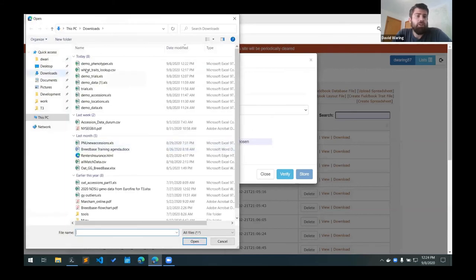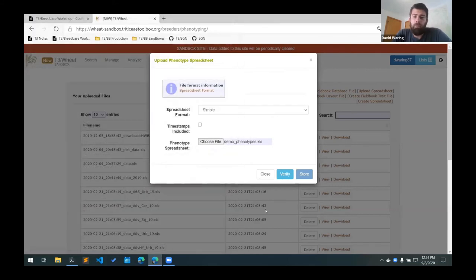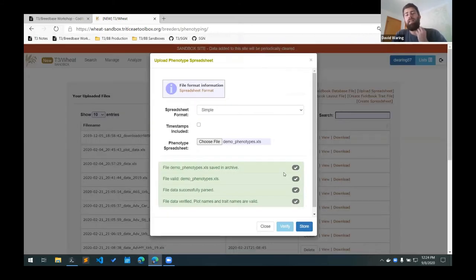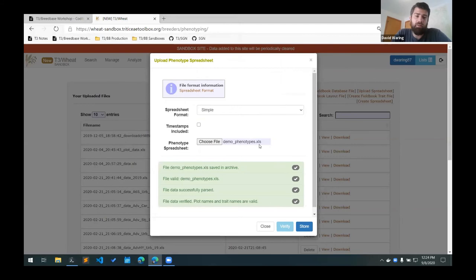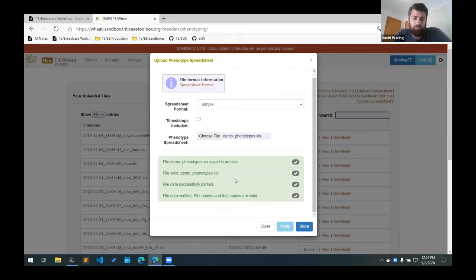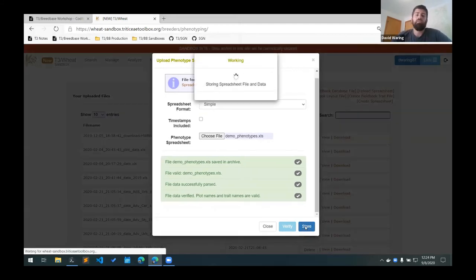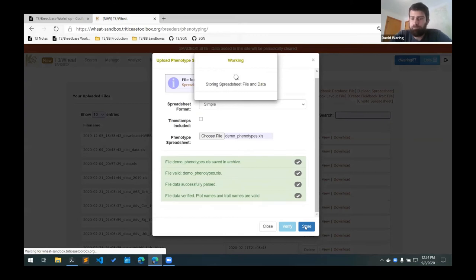We choose our file here. The first thing you have to do is click this verify button and that will verify the plot names and the trait names to make sure they're correct. And if that's all good, then you can click the store button and it will store those trials in the database.